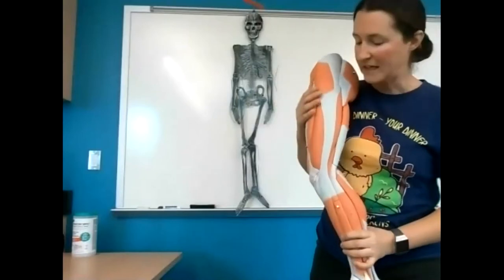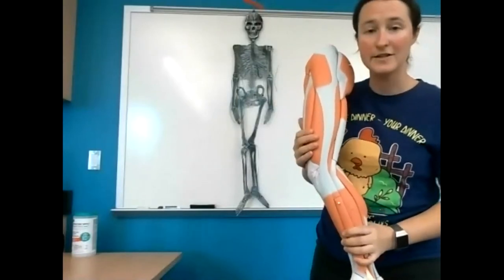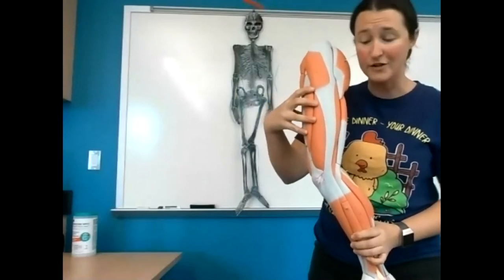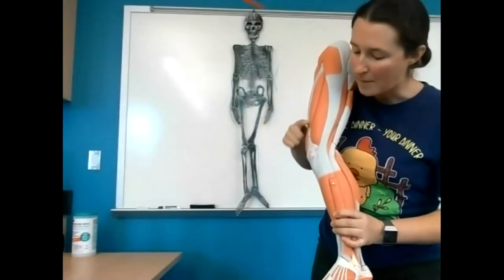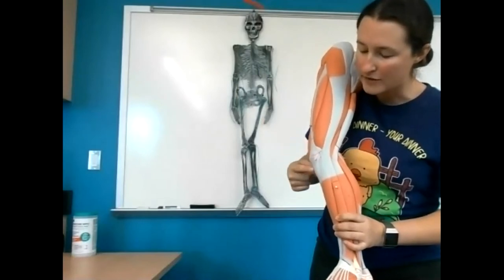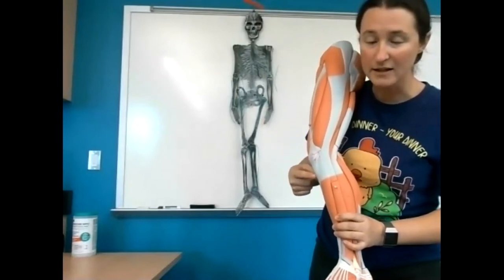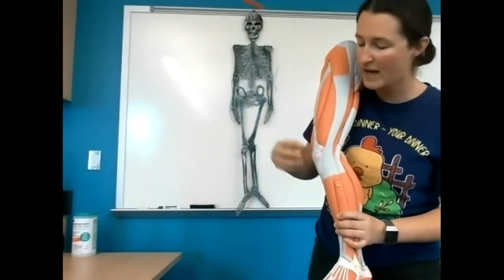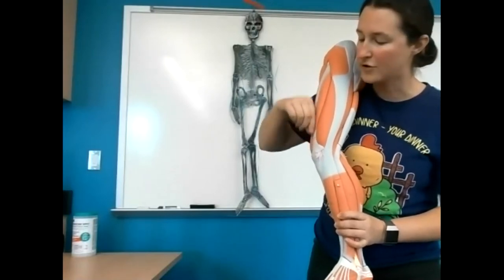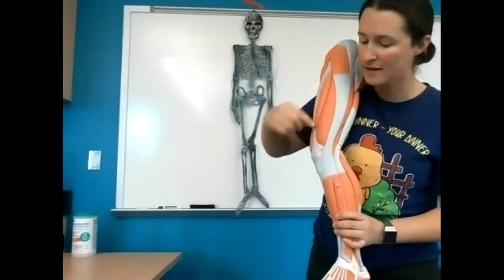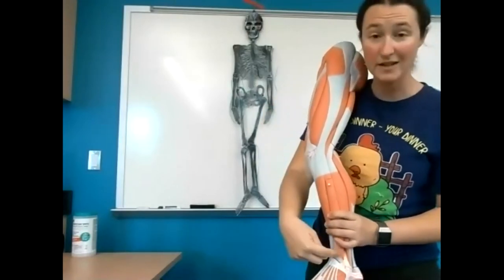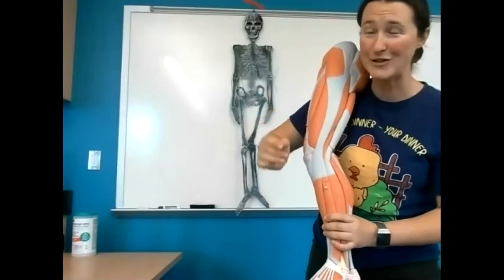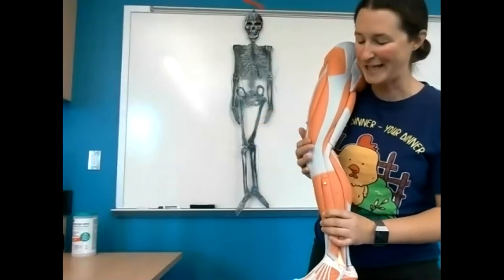There are going to be muscles on the chicken leg that are on the anterior side — those are the quadriceps femoris, the quads of the chicken. These muscles insert lateral to the kneecap or the patella bone. When these muscles shorten, the entire drumstick — the calf — is going to kick out.